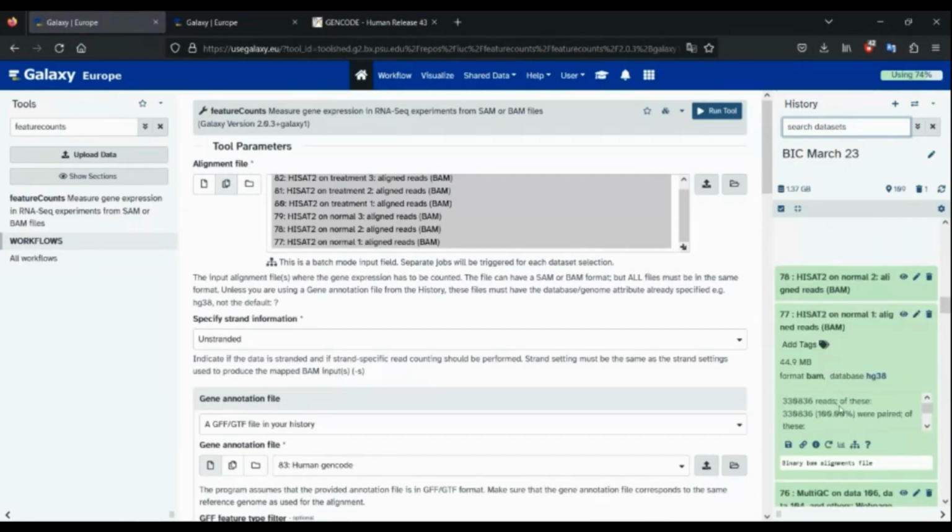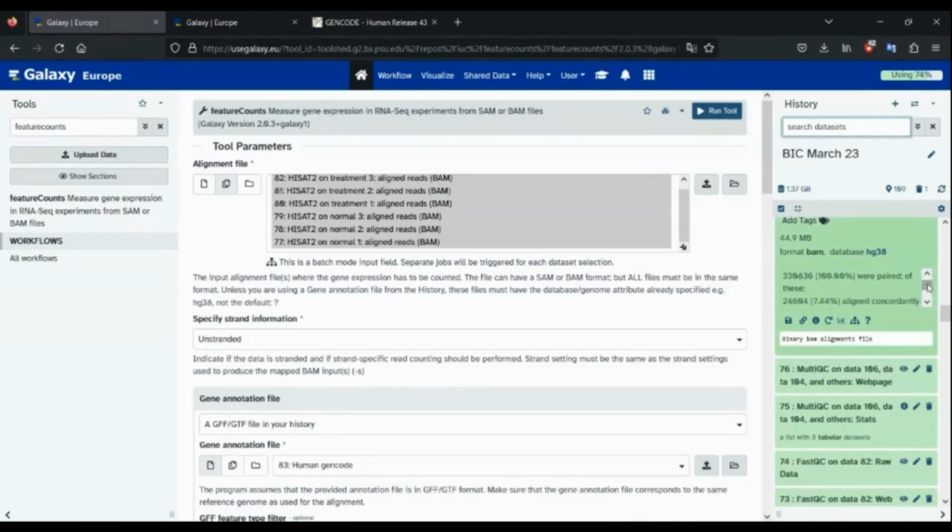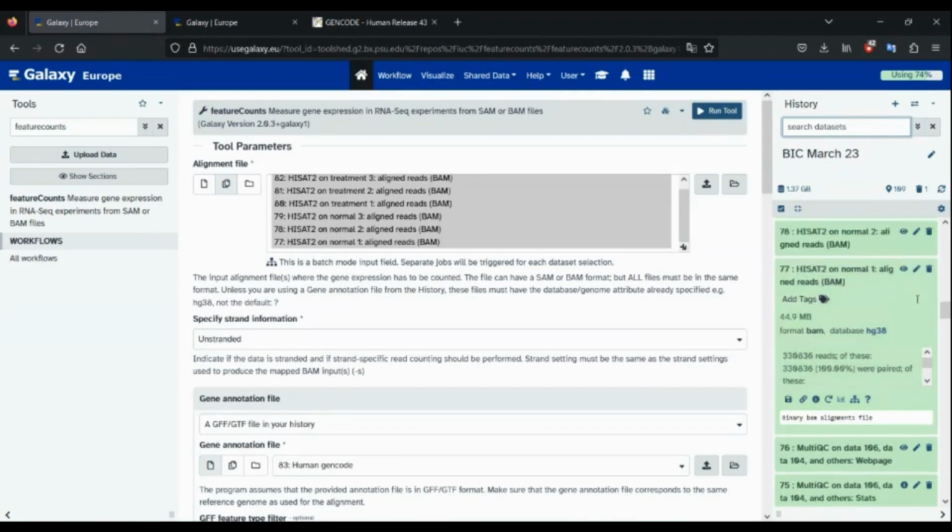So the overall alignment rate, if you calculate, it's going to be 87.76 plus 4.8. So overall, it's okay-ish because what you see here is that the total alignment rate is greater than 90. So that's pretty good because if it falls below 90, if it's around the 80-ish mark, then that's going to be a problem later on because that means that the genome that you have aligned is actually not aligning to the sequence. That means you're either using the wrong genome as your reference. Maybe there's something wrong with your sequence overall. Maybe there's contamination. Maybe it's mixed up with some other genome. So those are things that you should know.